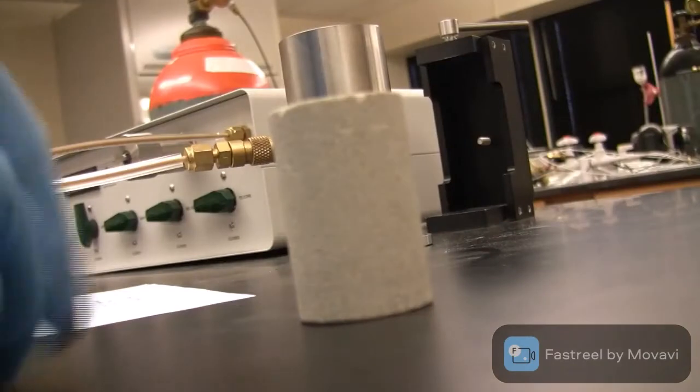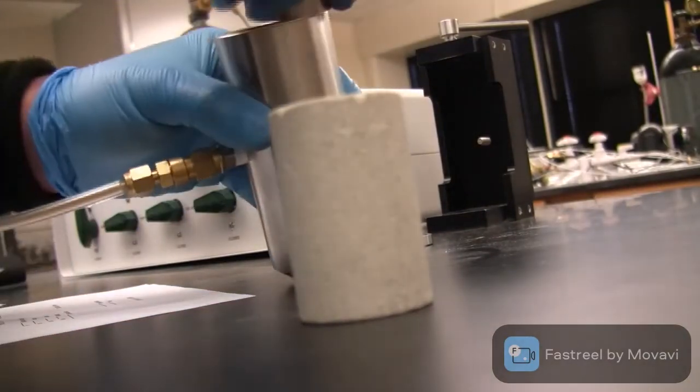So slightly taller than the core. I'd rather use these ones. Okay. Let's consider D and E as the ones I'm going to remove, and the rest are the ones I'm going to put inside my chamber.